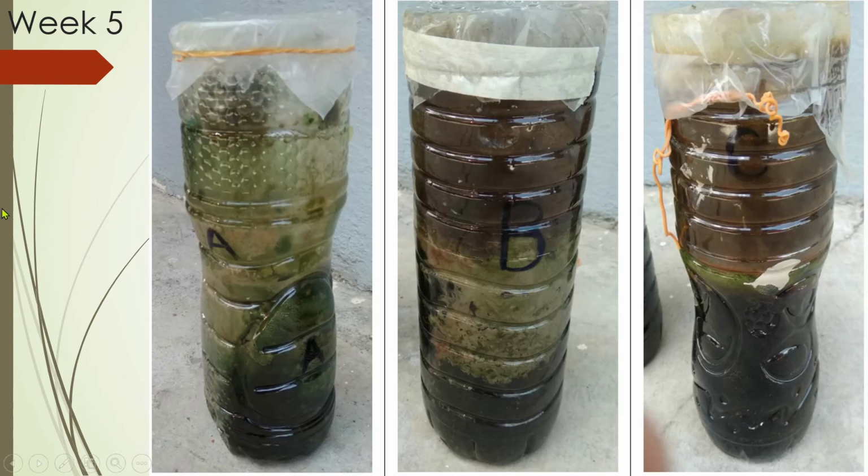And finally, by week 5, the whole control column has lots of algae and cyanobacteria, except for the anaerobic area here. Whereas for column B, you see a whitish tinge. This is probably from calcium sulfide depositions, because in column B, calcium sulfate was added, but in column C, ferrous sulfate.